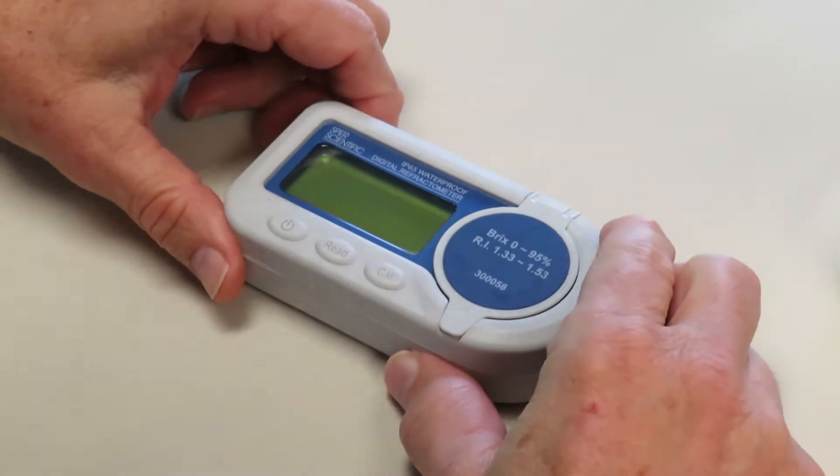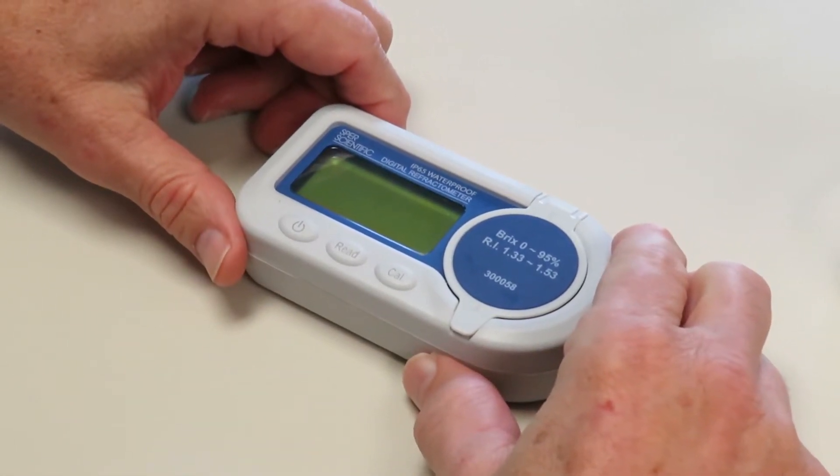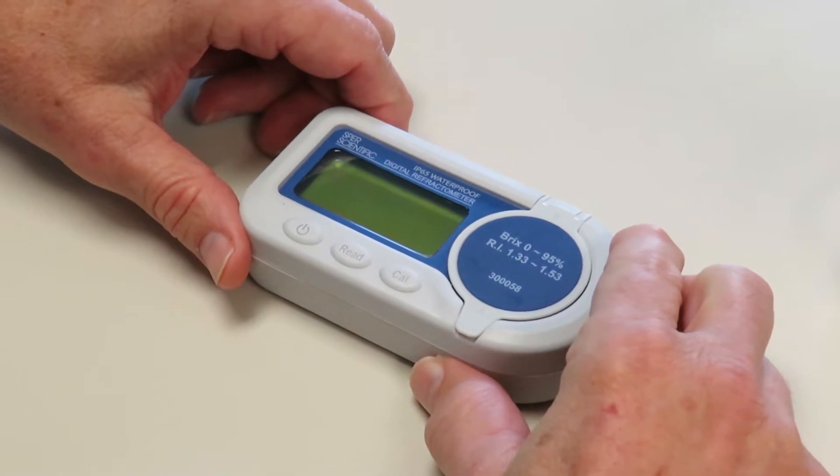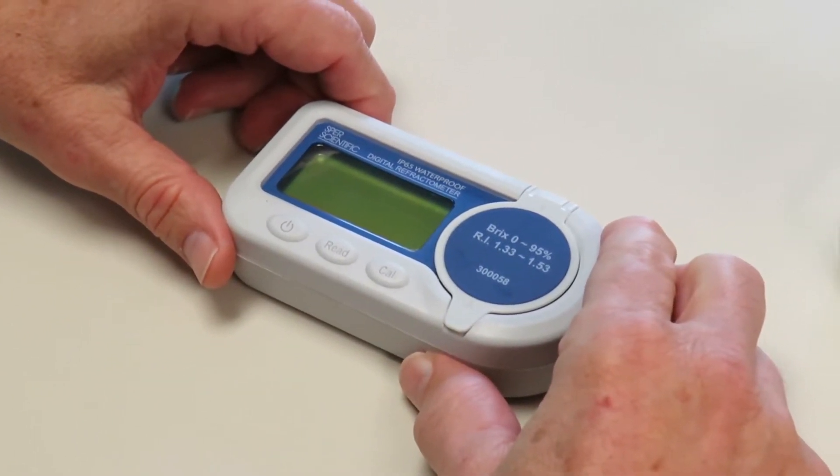All right, today I'm going to show you how to calibrate and use our waterproof digital refractometer series. This is the 3-0-0-0-58, but all of the units in this series will work the same way.